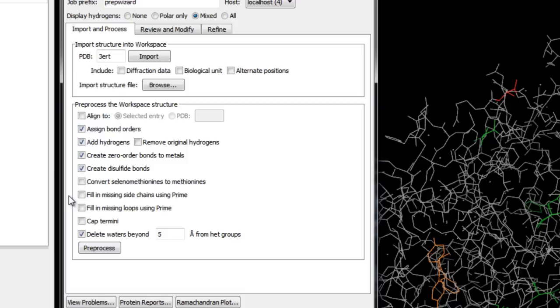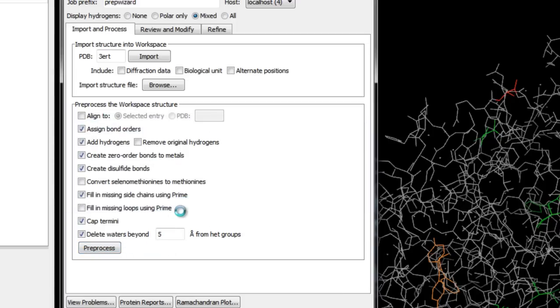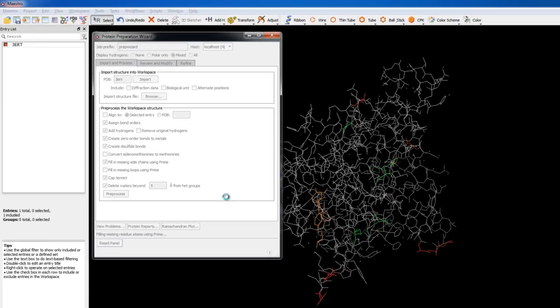Since we know we have missing sidechain atoms shown in red, we'll check Fill in Missing Sidechains. The Cap Termini option adds N-acyl and N-methylamide groups to uncapped N/C-termini, including chain breaks where residues are missing. If breaks are far from the binding site, capping may be sufficient; otherwise, Fill in Missing Loops using Prime is preferred. The option to delete waters more than five angstroms from het groups retains binding-relevant waters while removing others. We'll click Pre-process and confirm we're also running Prime.